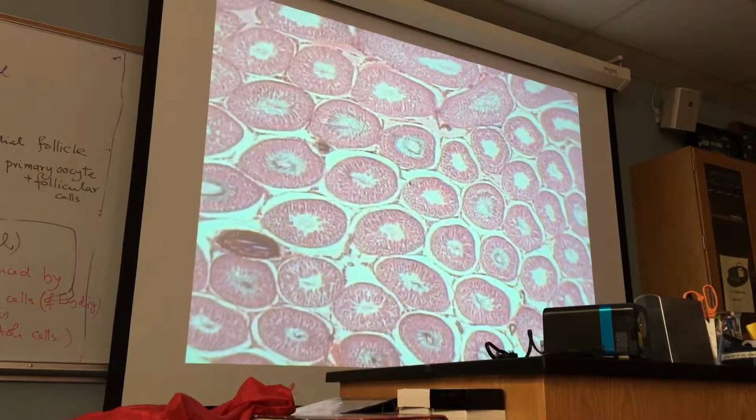You get that? Any endocrine cell can be called endocrinocyte, but what kind of endocrinocyte? Interstitial endocrinocyte. If I ask you, what is the function of the cells as indicated? To make or produce or secrete testosterone.